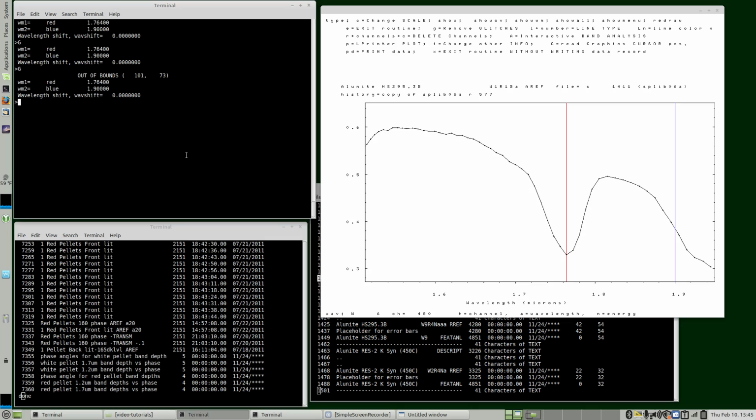Okay, that's a good overview of plotting. You can plot many spectra. The overlay functions help. If you go through the messages on how to, you can plot band depths or have band depths up here. Let's actually do a couple more things.